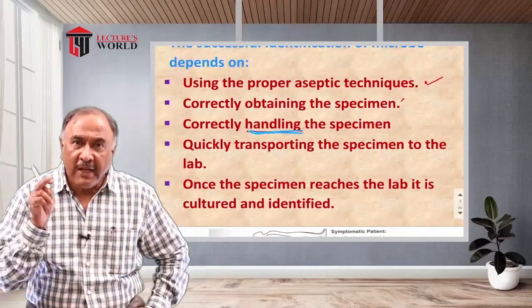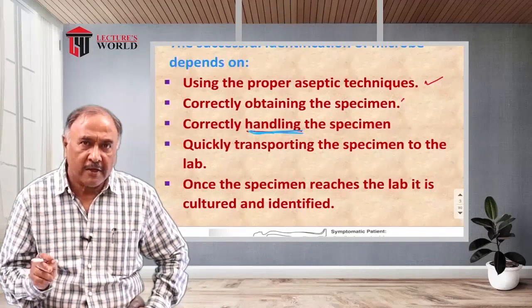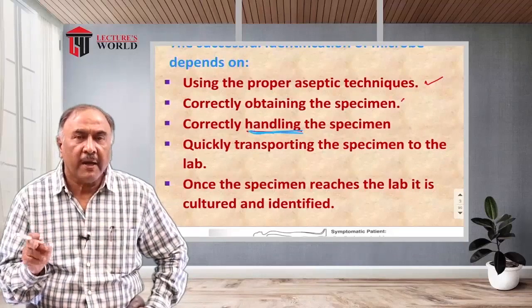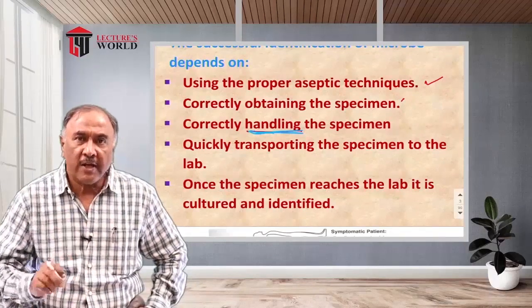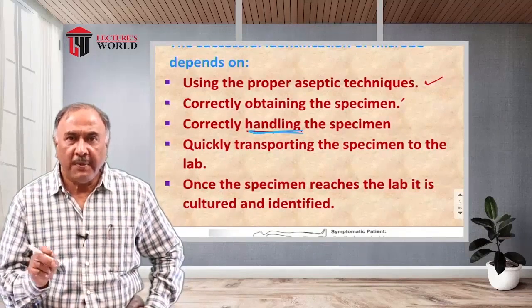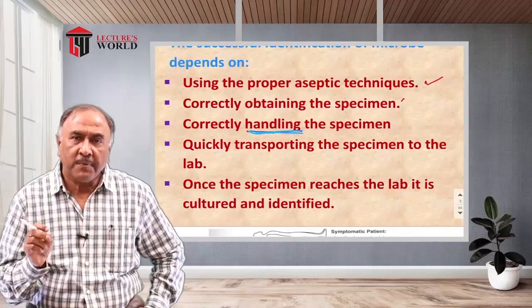It should be clean, and not only clean but also sterilized, because cleaning does not mean that a material is sterile. We want both things.